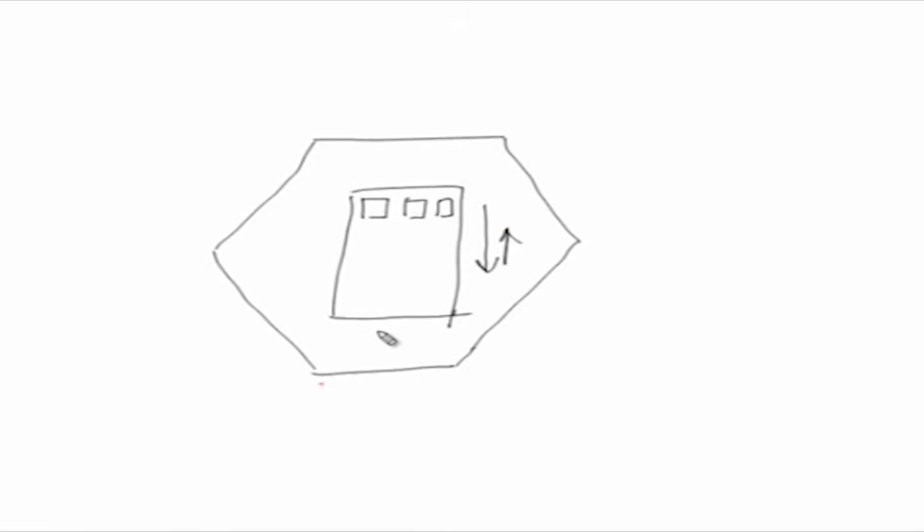Accordingly, these 4 electrodes, which are platinum wires, will change: either they will be negative or they will be positive. Now remember, in field inversion gel electrophoresis, you want the molecules to move in the forward direction.